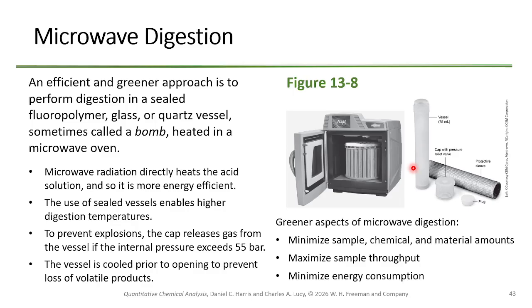A bomb calorimeter is essentially a bombshell. It keeps all the heat and pressure in and doesn't allow it to release. You don't normally allow them to fail. Otherwise, you would regret that, because that would be an actual bomb.